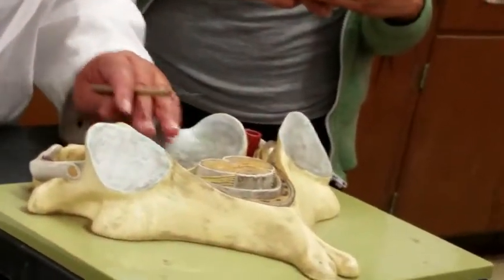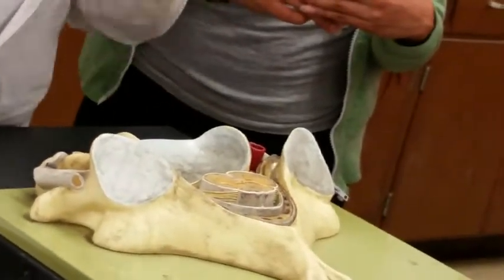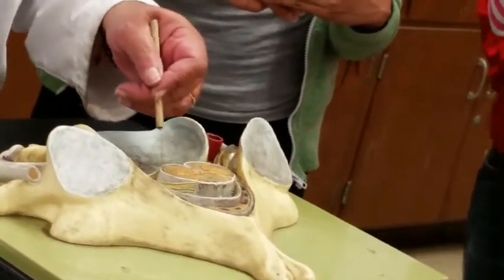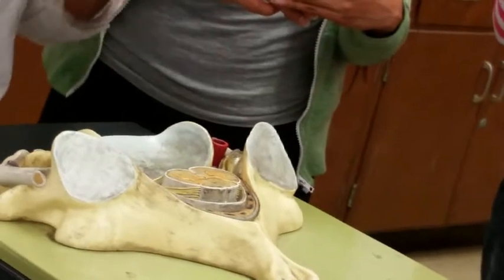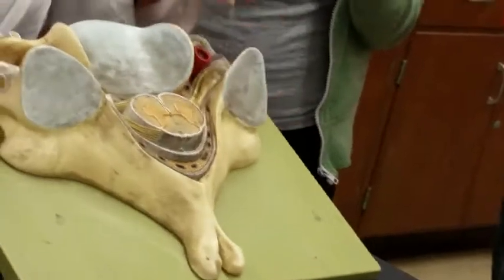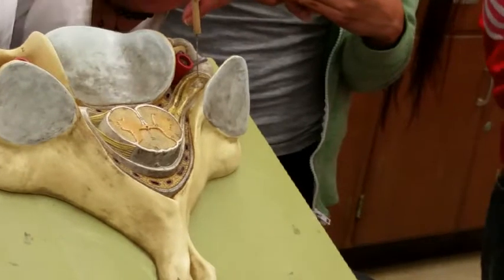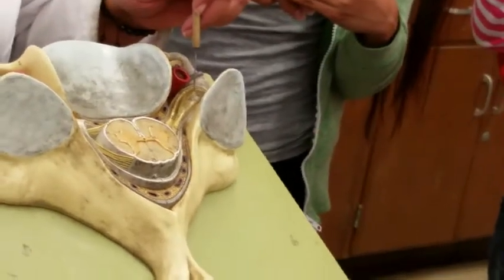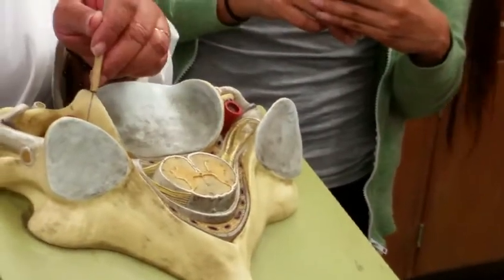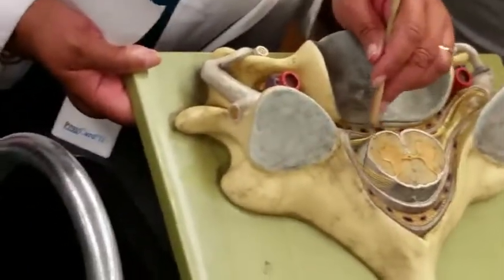So in the lecture you heard about the word ganglion, which is a collection of nerve cell bodies outside of the CNS. That means that they would lie outside of the brain and the spinal cord. Collection means they're going to be fat. So this one is not covered, coming from here, from the dorsal or the posterior side. So this is the dorsal root ganglion, very fat. Dorsal root ganglion. This one is covered, still fat, dorsal root ganglion, coming from this way.